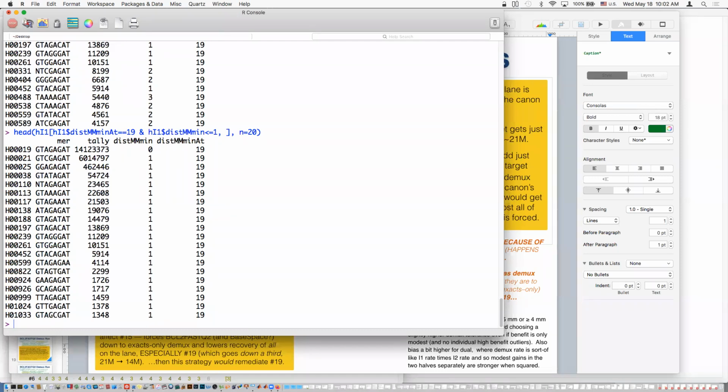But you can see here, it's basically very much in that first variant. And so if you're only going to add 1 variant, this is the guy you would add. And how much are you recovering then of the full thing here, right? So let me save that. So that's our less than or equal to 1 mismatch total answer for number 19.